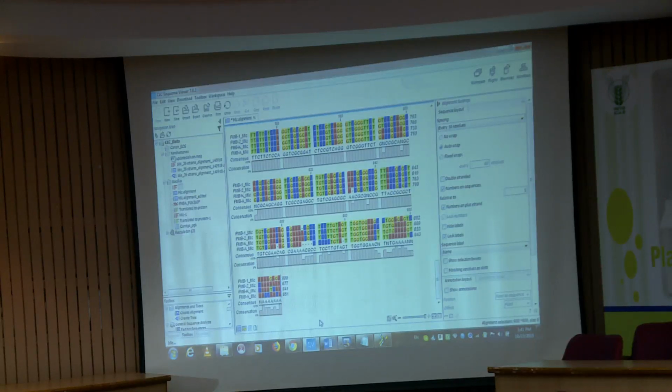Then only can I compare if all the 4 have a similar number of bases. This is the trimming part, 5' to 3'. In between, if some variation is there, let us suppose you find a gap, this is a gap. If I just see it, I will assume that maybe it is a deletion of that particular base in my sample.